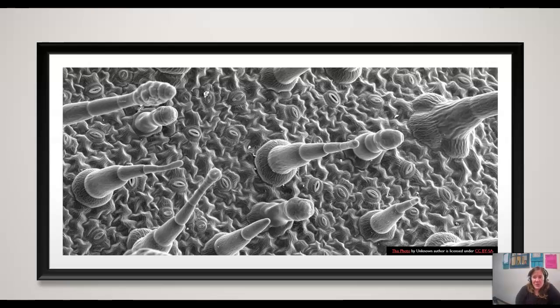Okay, and what does this alien surface represent? It's not really an alien surface. I hope you guys know that this was just taken with an electron microscope.